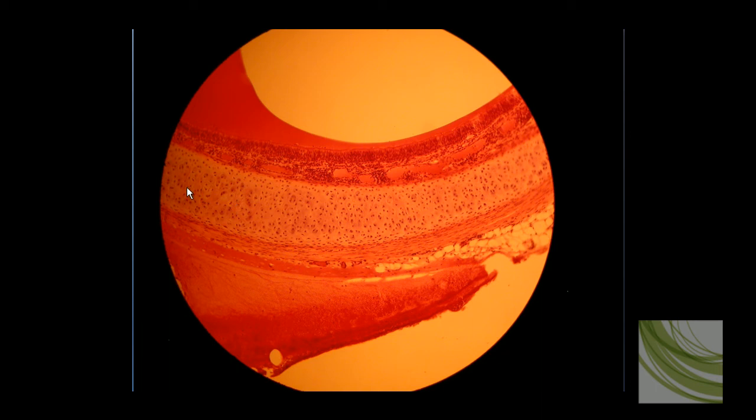Okay, here is that same tissue slide. We're now at the 10X objective. We can see some little dark chondrocytes in there. The lacuna are not that apparent, but we can see that there are no fibers between the lacuna, so it's a smooth matrix, which is a primary characteristic of this hyaline cartilage.